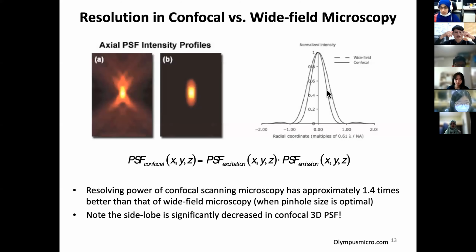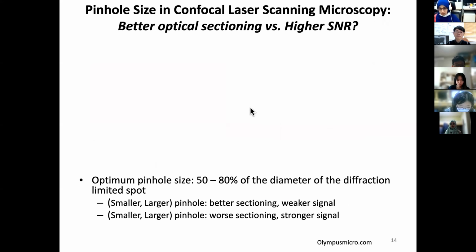That makes it thinner and reducing in terms of confocal. So that's the trick why confocal provides you a better resolution. But here's a practical question. Hey, wait a second. The mechanism of confocal is using a pinhole, and what kind of size of pinhole would be the optimal? So these are all the questions whenever you are using a confocal laser scan microscope.